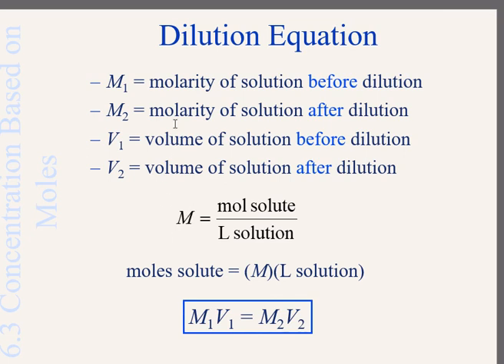Let's say it's DI water. Then you stopper it and shake it, and then you can use that solution as a dilute version of the original concentrated solution. How dilute is the new solution? Well, we only took 1/10 of the number of moles present in the original solution and we diluted it with 9/10 water. So the dilution is a tenfold dilution. Whatever the original concentration was, let's say it was 20 molar, our dilute solution is then 2 molar.